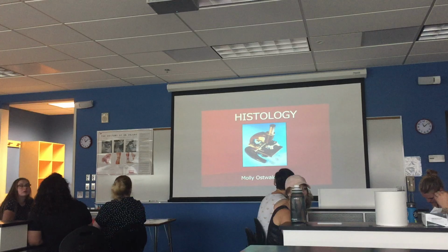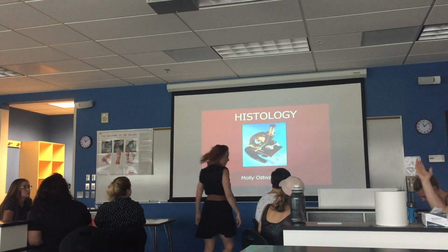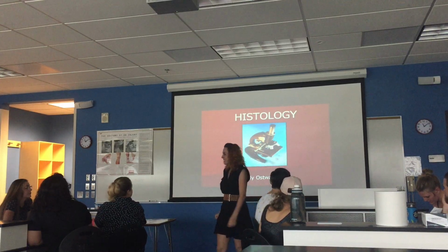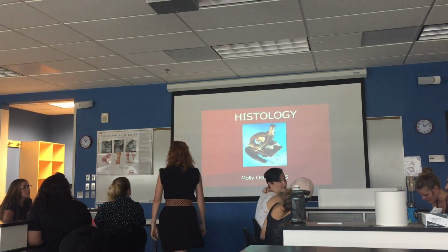Okay, who's done histology before? No, nobody's ever looked at tissues? I mean, you've looked at what under the microscope before? Cheek cells. Okay, that's fun. Pond water, maybe. And yeah? Okay, but not tissues and identifying tissues.